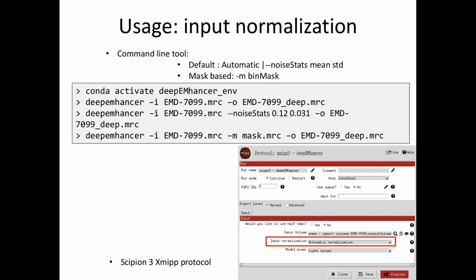So I guess, but also one related to you were just talking about the masking, and you'd mentioned this is a standard 1-0 binary mask. How would you recommend people handle cases where there's density that we're pretty sure is solvent, density that we're pretty sure is protein, and density where we just don't know? And in a binary mask, you've got to pick one.